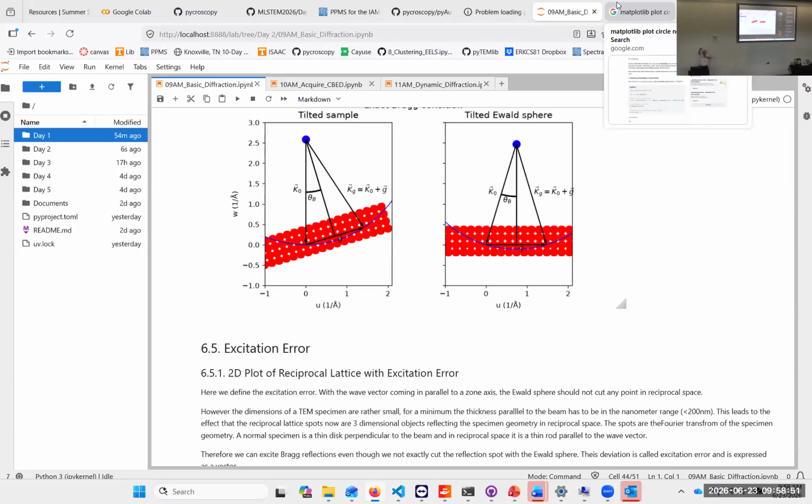So the simplest one is I come just down into the reciprocal lattice. But I can tilt that by 3, 4, 5 degrees, 15 degrees, according to some kind of different Miller indices, right? It doesn't matter where I'm going. And then I just do the same formula as always.